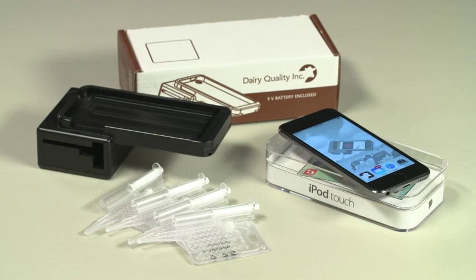Thank you for purchasing the RT10 device. Here are the basics you will need to conduct a somatic cell test: the RT10 device, an iPod Touch 5th or 6th generation or iPhone 5 or 5S, and a supply of milk sampling slides. Please ensure your app is up to date before starting testing.